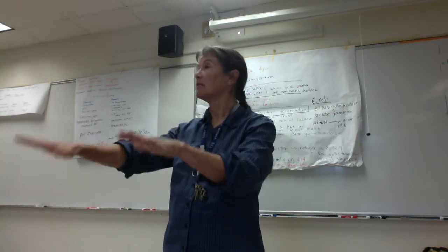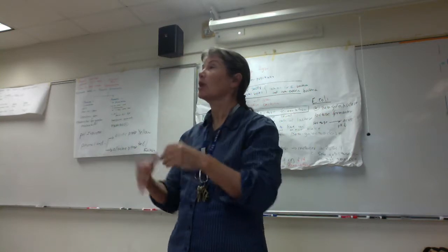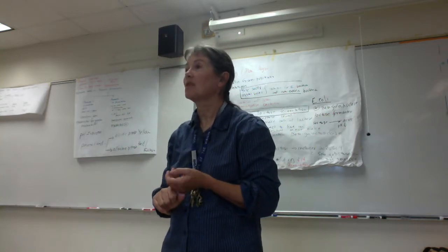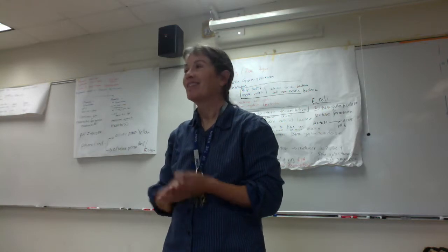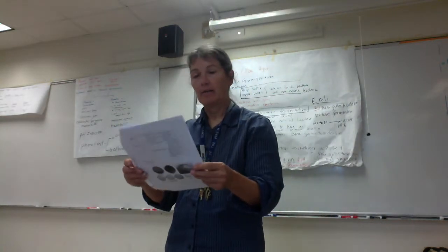So you need to be careful of the surfaces your hands are coming in contact with. Keep them away from your face. Make sure you wash your hands a lot. And that's probably one of the best ways to stay healthy. Wash your hands a lot and keep your hands away from your face. Okay. All right, folks. So let's take a look at our handout again.